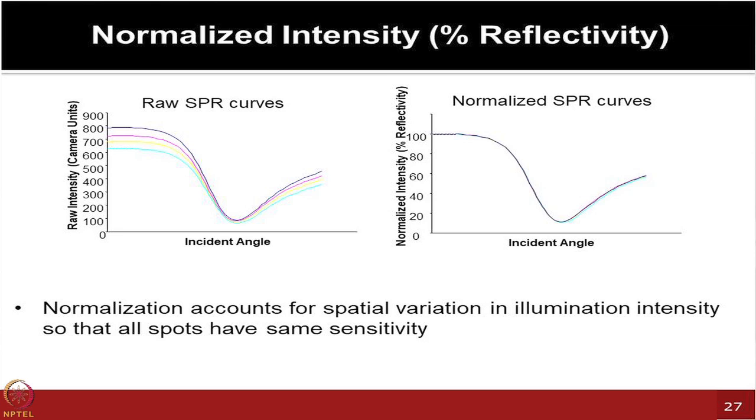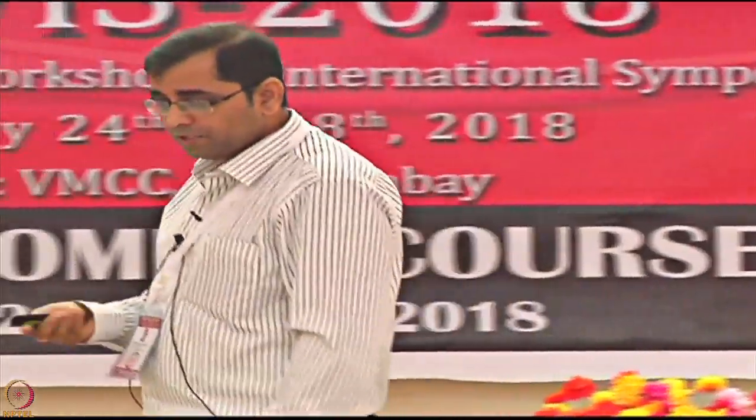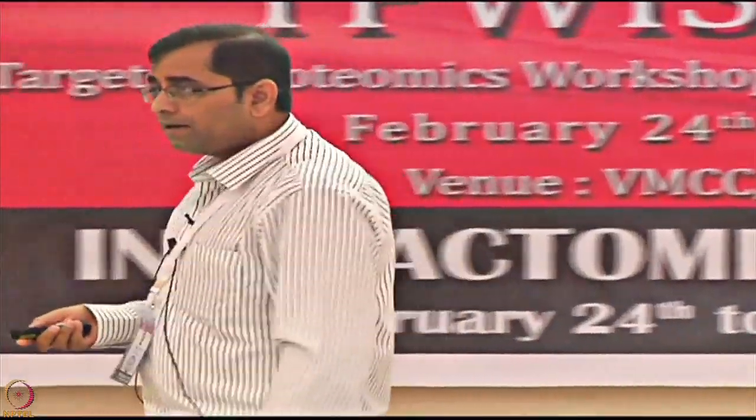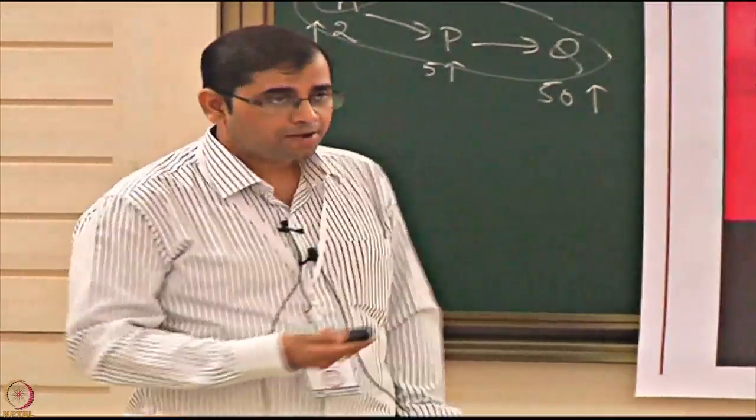So then you have to normalize them again, so that everything is comparable. You can see the intensity looking different here for different angles. Now you have normalized the SPR curves and everything looks the same. Then you have the opportunity to compare their signals. The SPR signals, which we talked about as the sensorgram, if your eyes are expert and tuned to look at the data, immediately start telling you a lot of information.